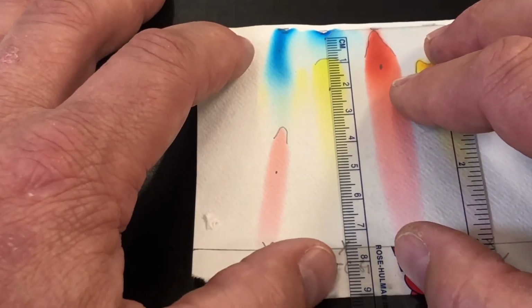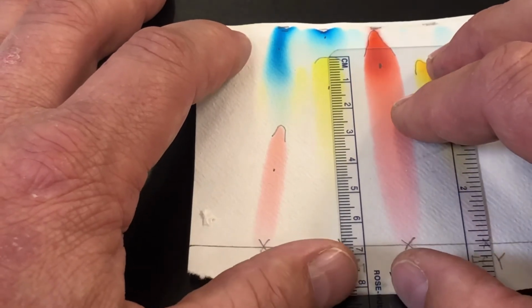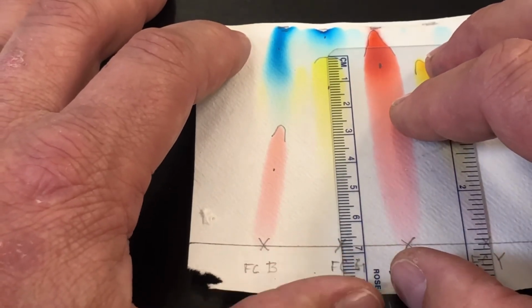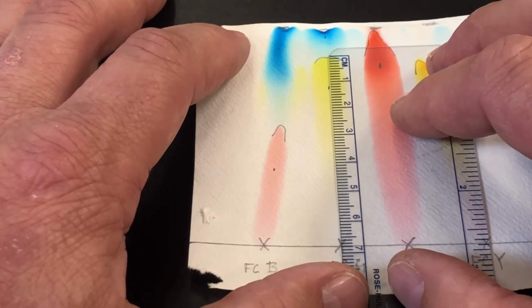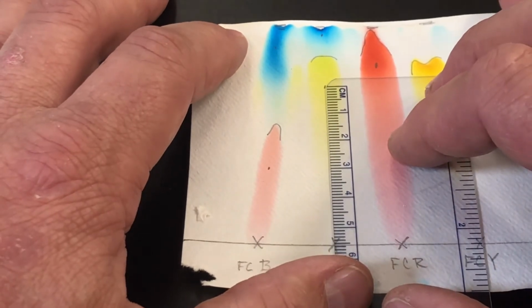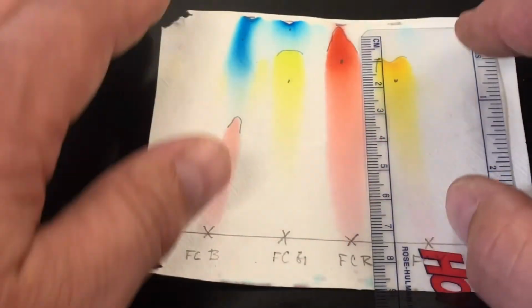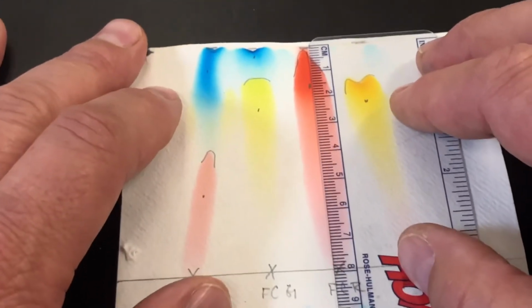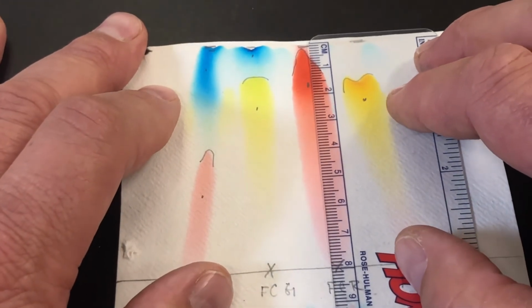The center mass is going to be 7.55. The yellow at the tip is 6.78. And then the center mass is going to be about 5.55.